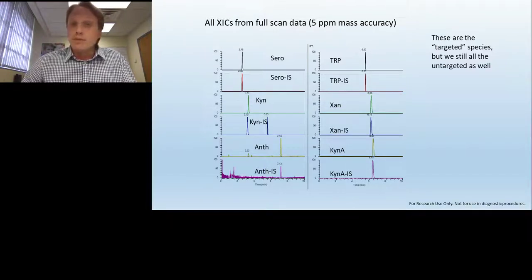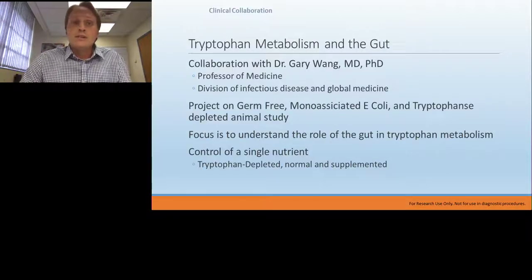So this is a method that we now apply. We use this quantified method for many different studies. And one study I'll show you as a highlight is tryptophan metabolism. So using an understanding of the role of our gut in metabolizing tryptophan within the body. And this is a collaboration with University of Florida professor Dr. Gary Wang in infectious disease and global medicine.